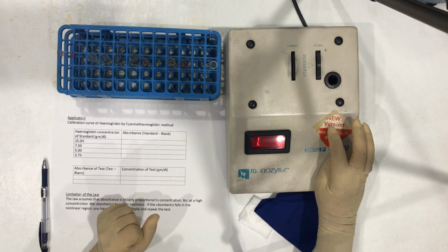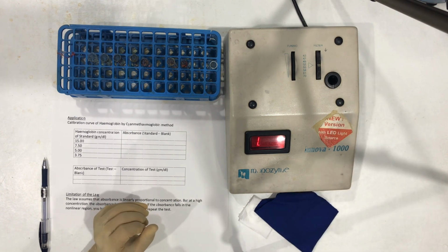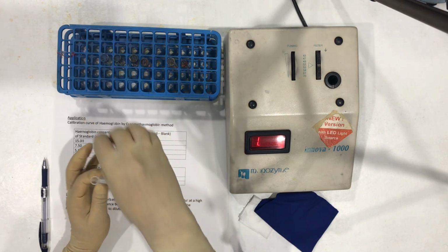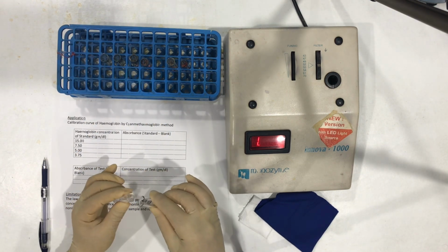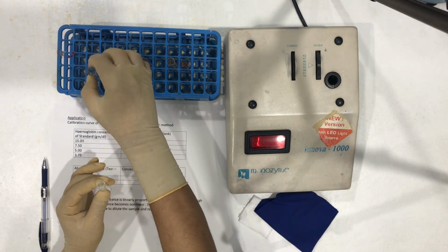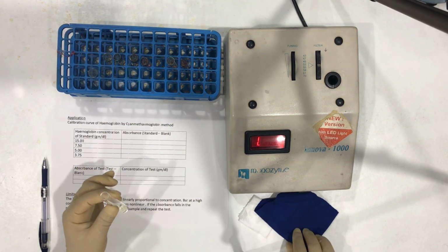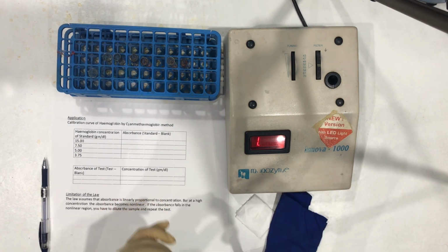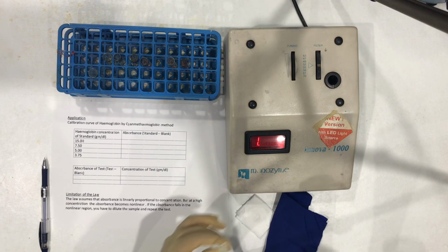So let us take the absorbance of the blank first. So this is our blank containing no hemoglobin, and let us see its absorbance.